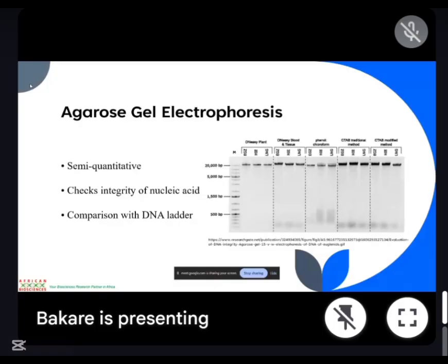So what this means now is that whatever I use, these three sets that are very bold, whatever downstream applications I use them for, I would definitely get a good result, no matter what. Even if that's my first time entering a lab, I would definitely get a good result. For those ones that are faint, it's not as if I'm not going to get a result, but their integrity is not as high as this.